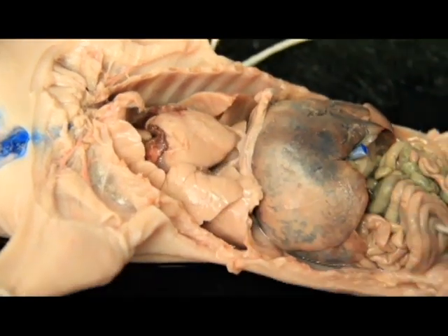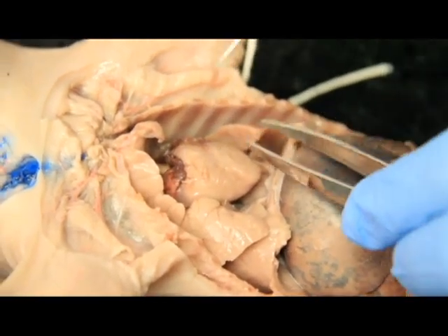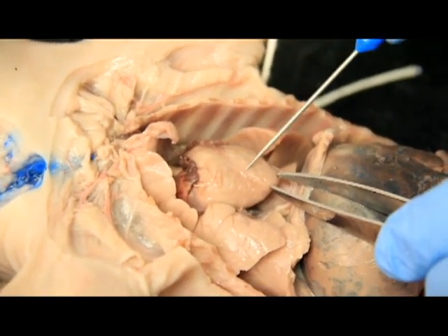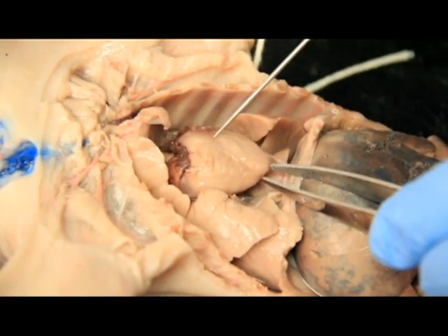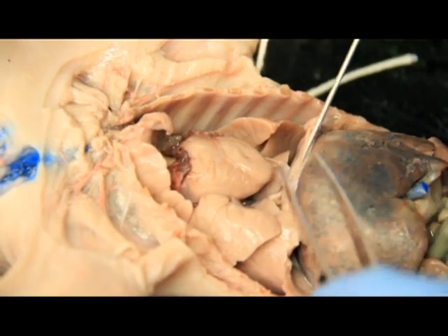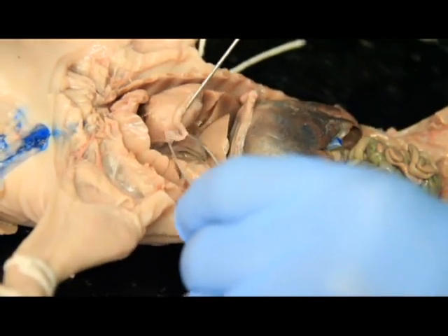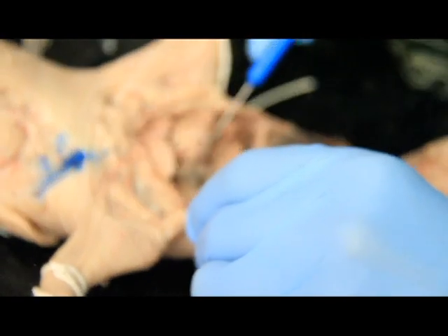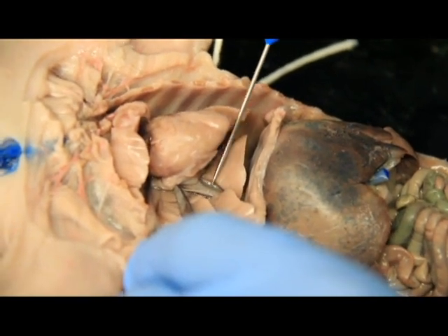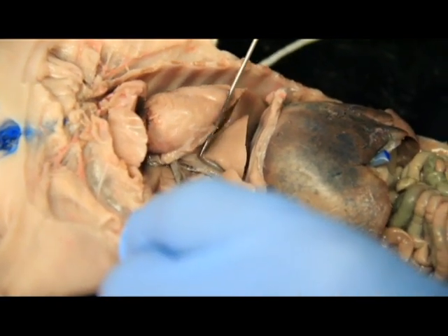We probably won't test you on the parts inside the heart, but we might. So remember, you need to be familiar with the atriums inside and the ventricles. Don't forget that crossing straight across the heart, it's not stained very pink, but the only thing that crosses the heart is the coronary artery. That's this little thin line right here. If we lift up the heart down here, which you can see if I cut some of this pericardium away, this is another continuation of that large blue vein, and that's the vena cava. This would be your caudal vena cava, and this one above the heart here would be your cranial vena cava. So remember, the vena cava goes all the length of the body.